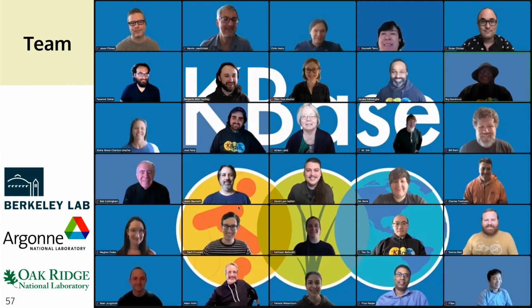Yeah, thanks again, Adam, for this fantastic webinar. It was great to see all of the integration of KBase features and the data that you used to do this analysis, and to get a little more depth of what you did compared to our speed run for GSP.